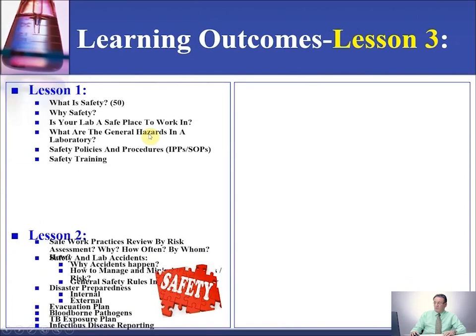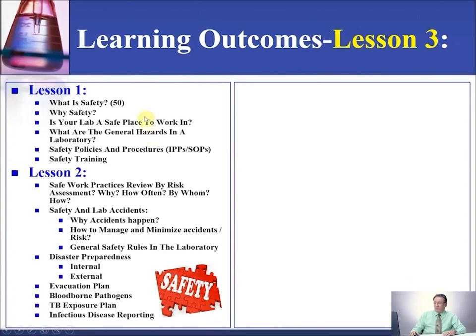In lesson 1, we covered the following. What is safety? Why safety? Is your lab a safe place to work in? What are the general hazards in a laboratory, safety policies and procedures, and safety training.